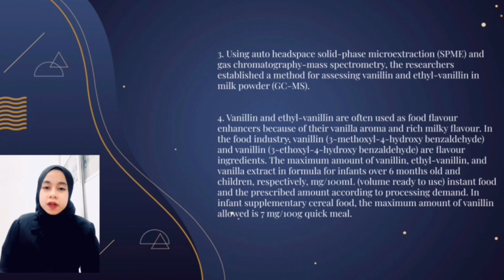The research developed a method for analyzing vanillin and ethyl vanillin in milk powder using auto headspace, solid phase microextraction (SPME), and gas chromatography-mass spectrometry (GC-MS).